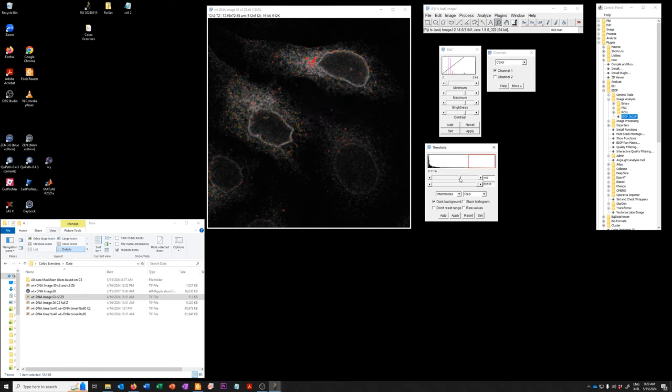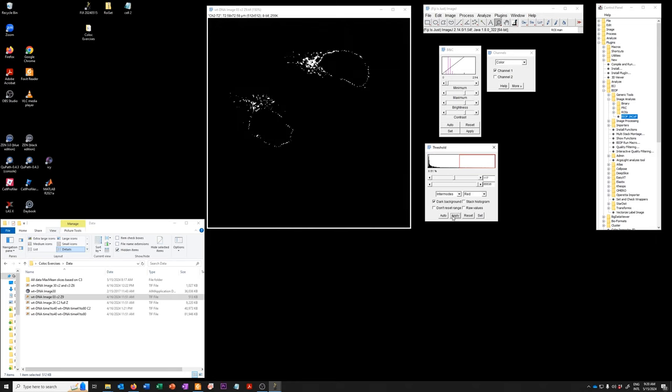You can accomplish the same thing obviously by dragging this and finally if you say apply it will change the image from the actual image with just an overlay to an image where the pixels are either zero in the ones that were below the threshold or 255 in the ones that were above threshold. So that is one way of exploring thresholding in Fiji.